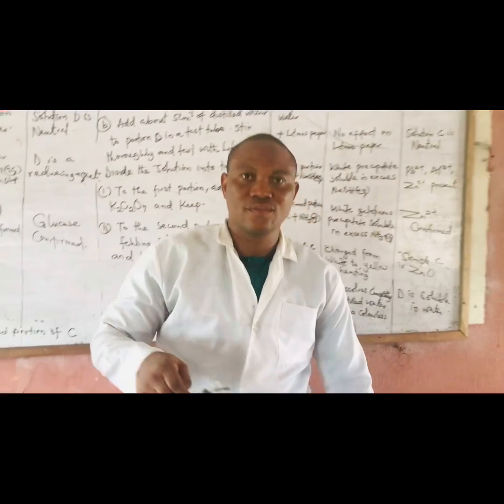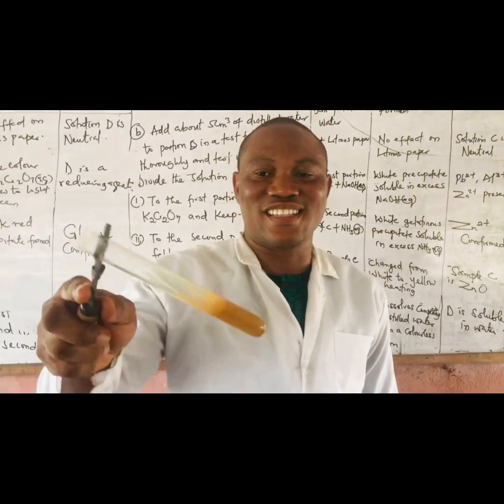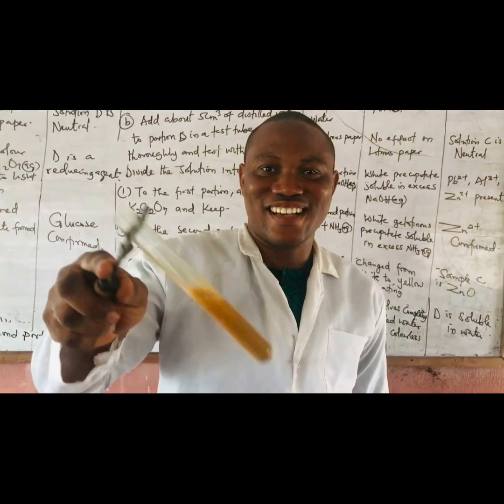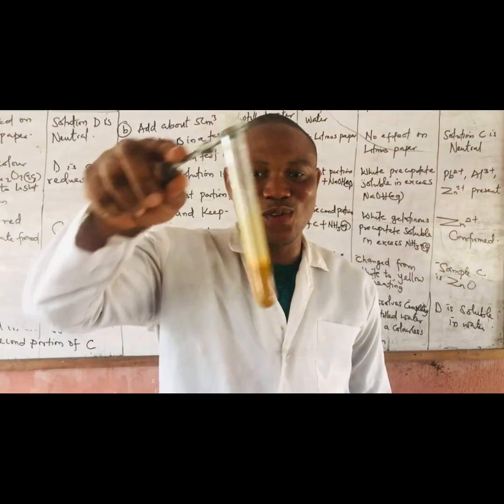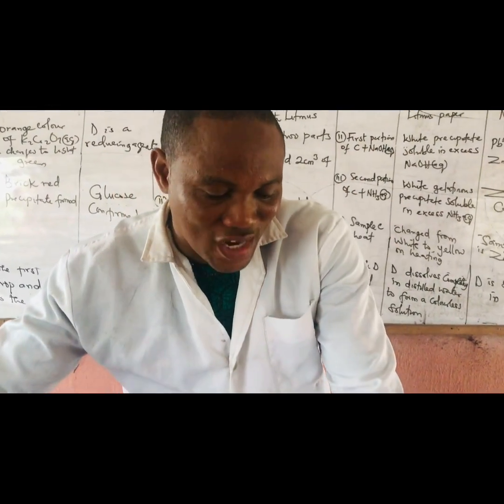That's just it. So particularly, I love this test. You can see the brick red. I love this glucose test, and that's just what you're testing for. So you can see the test. Okay, you can see even this one now.